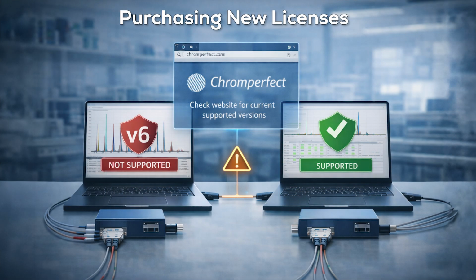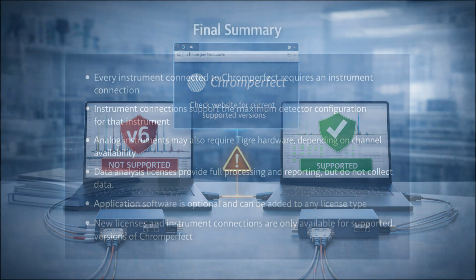Supported versions and license issuing. One final important point. New licenses and new instrument connections can only be issued for supported versions of Chromperfect. You should always check the Chromperfect website to confirm which versions are currently supported when placing an order. For example, version 6 of Chromperfect is no longer supported, so if a customer wants to purchase a new instrument connection for this system, they must also upgrade the software to the latest supported version.